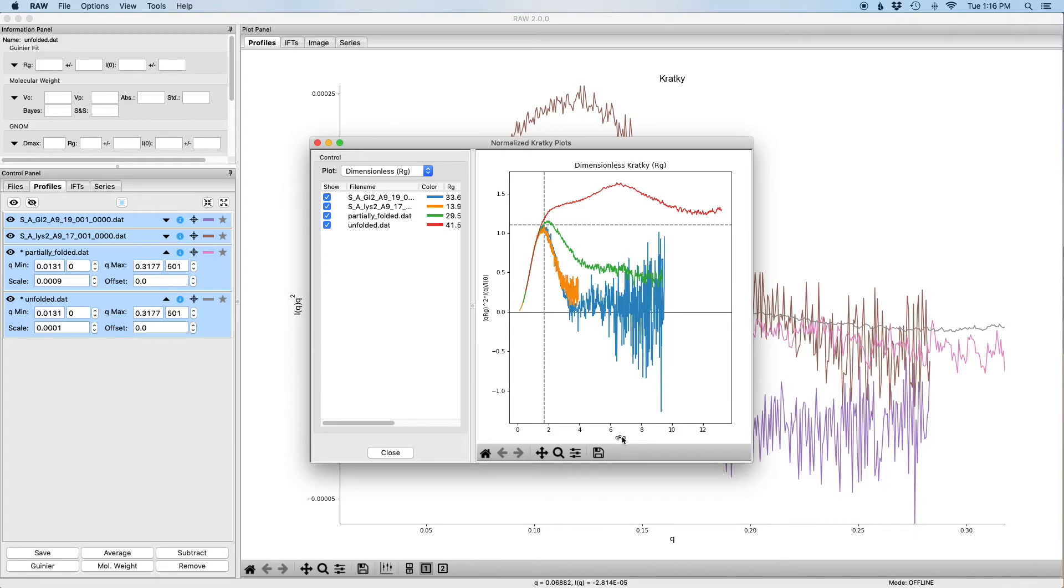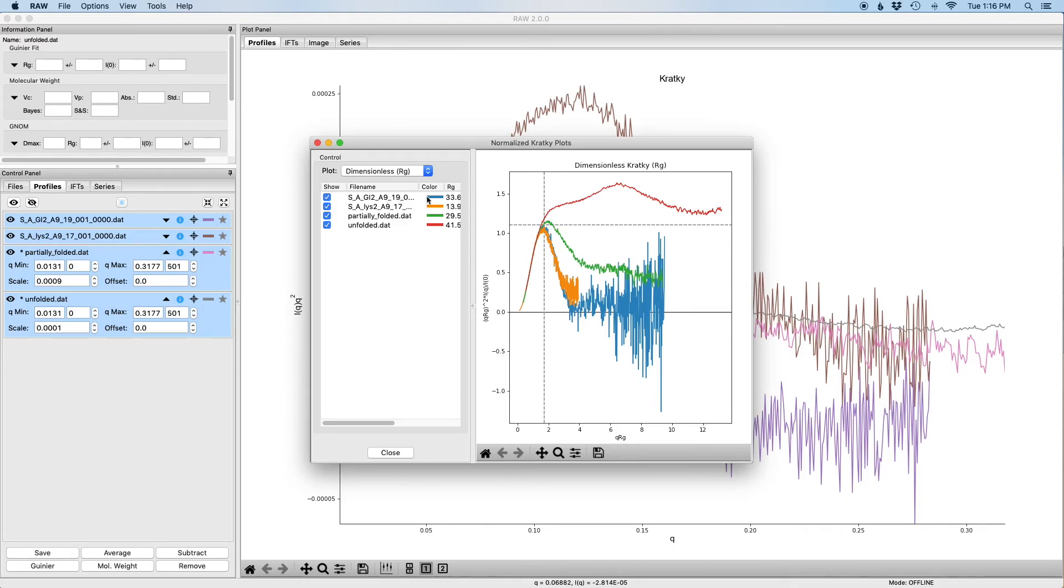This essentially removes the scale factors that come from the size, the molecular weight and the concentration of the sample. In this case, you can now see that for glucose isomerase and lysozyme, which are the blue and the orange, they're showing us essentially the same shape, which is what we'd expect because they're both very globular and we've removed the effects of the size.